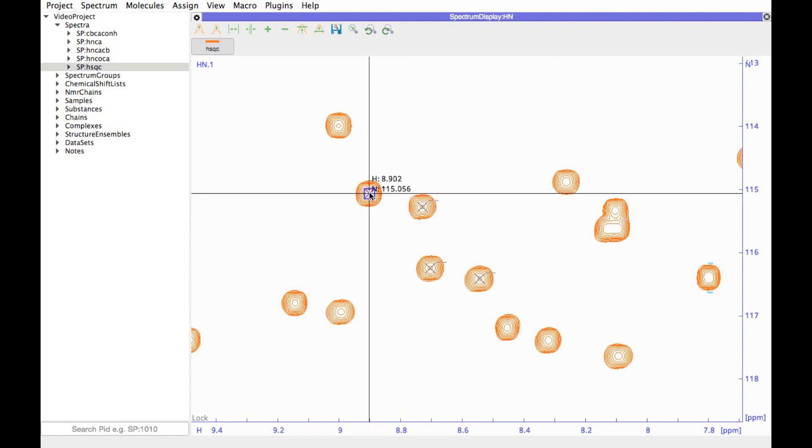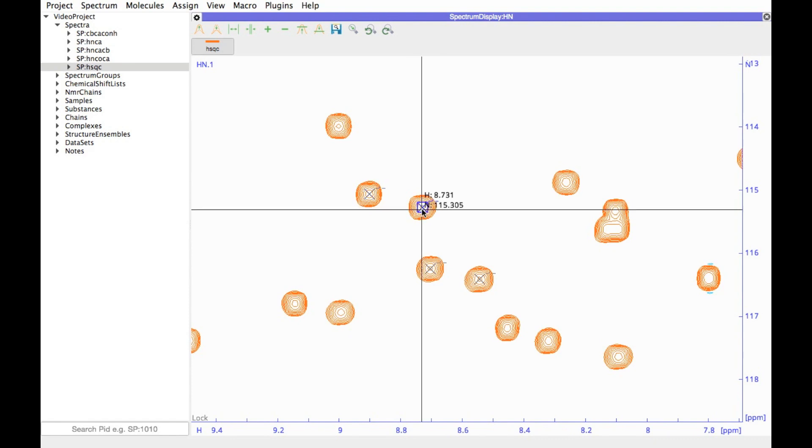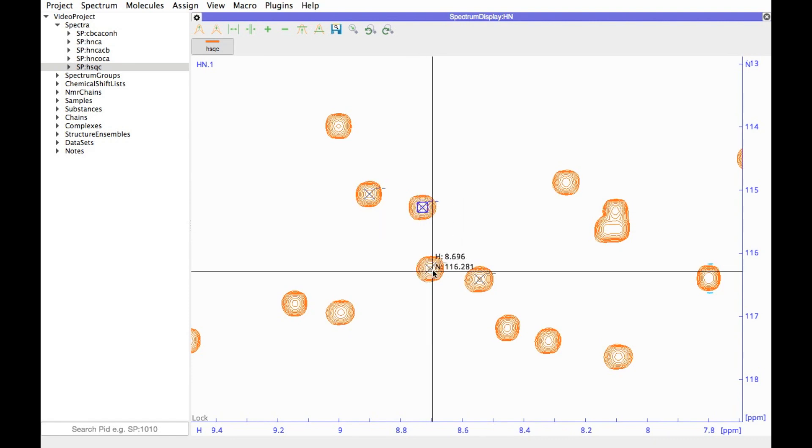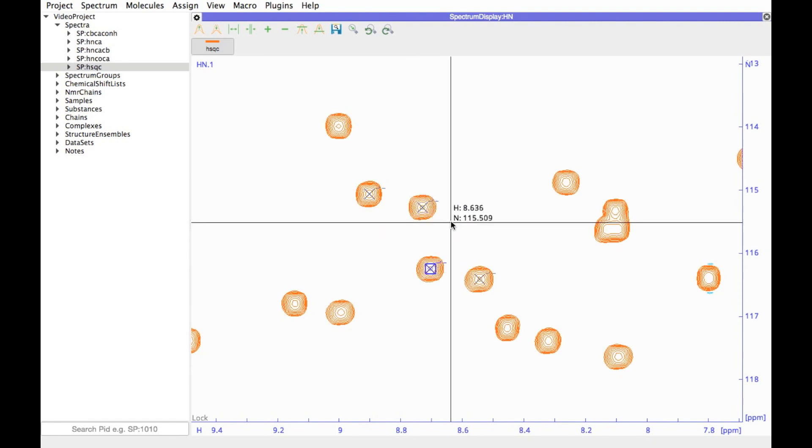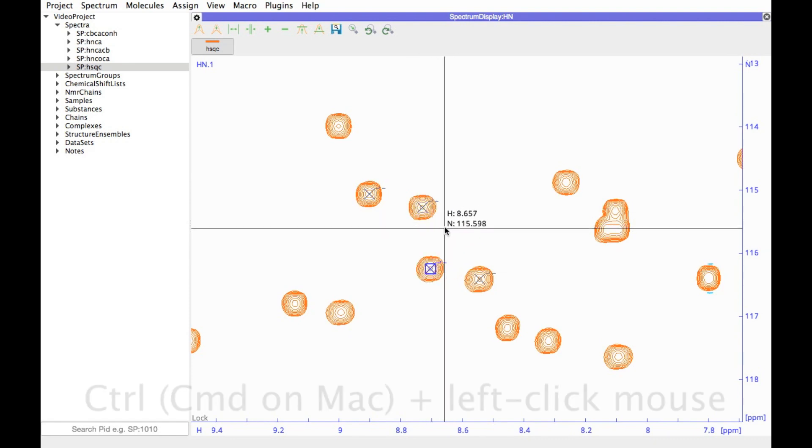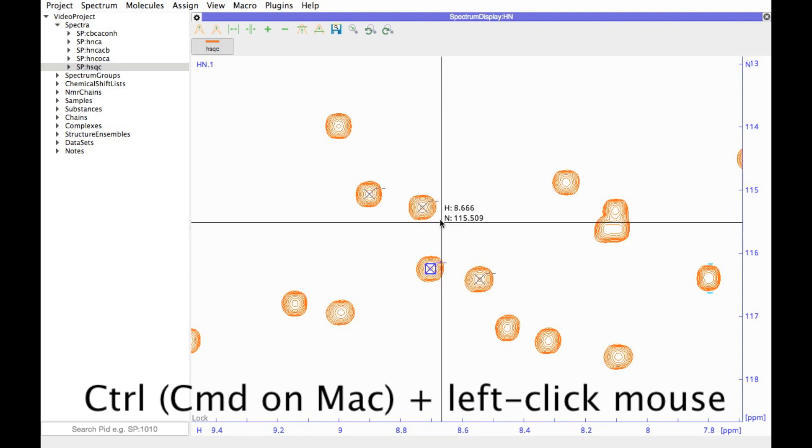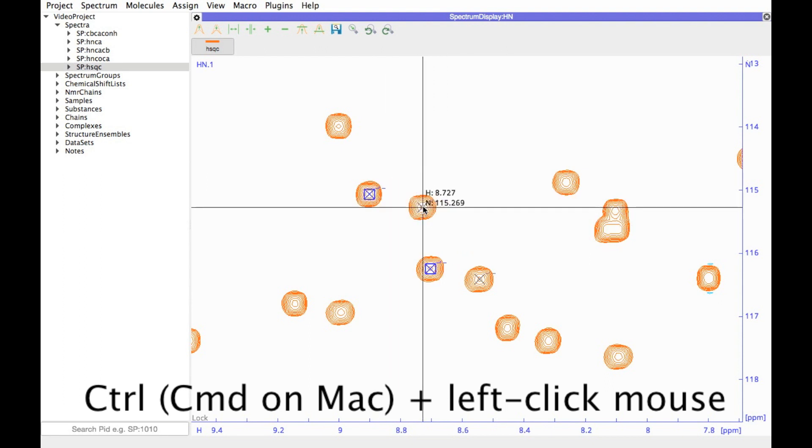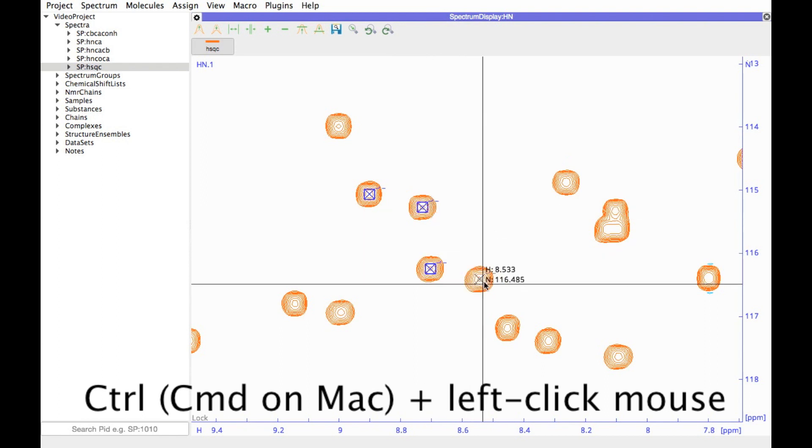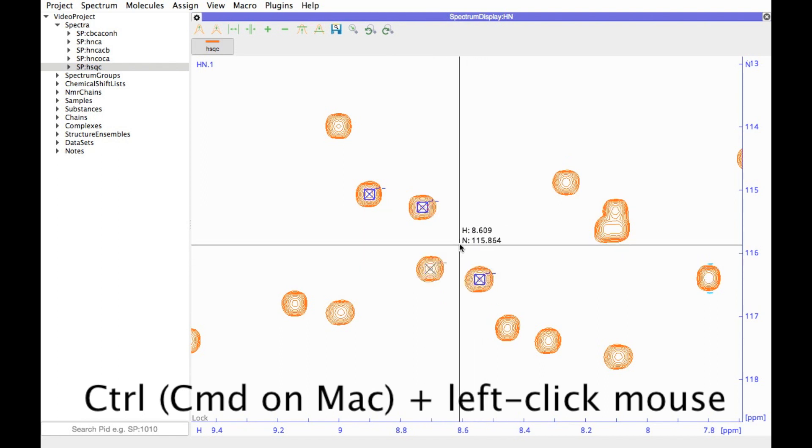You can left click on a peak to select it. If you want to select several peaks at the same time, then hold down either the control key, or on a Mac computer it would be the command key, and then select two peaks. You can select several or deselect them again as you wish.